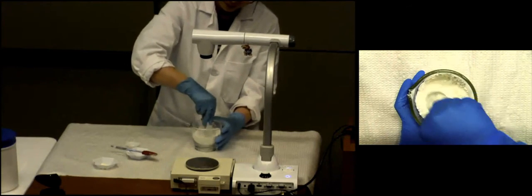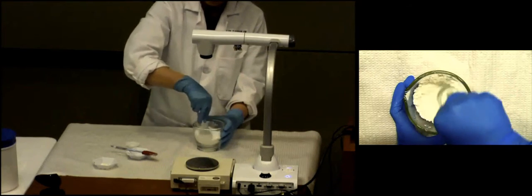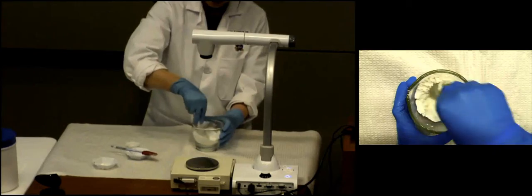I will warn some of you that want to get a lab, kind of take your mortar and do the blender thing. Okay, remember, keep them in. Don't let it fly out everywhere. You do need to be careful, especially when you're getting a large amount of powder in there, that the powder doesn't come flying out of there with too aggressive mixing or triturating. Okay.